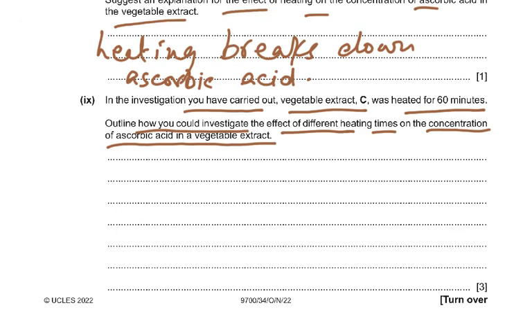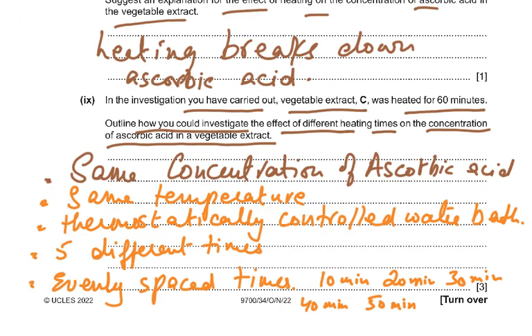So, 5 different times, so that you can see whether the boiling time has any effect on the concentration of ascorbic acid which remains. But you have to use the same concentration. Here you would not change the concentration of ascorbic acid. You would use one concentration, 0.1% or 1% or 2%, whatever you wanted to use of the ascorbic acid. Same concentration of ascorbic acid, same temperature, use a thermostatically controlled water bath to maintain the temperature, but of course you heat it for different times, 5 different times.